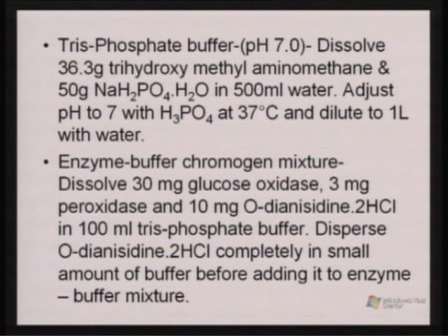Here the adjustment of pH is very important. The tris phosphate buffer must have a pH of 7. So you need to take care at the time of analysis. You should adjust the pH at the time of analysis only. It should not be an old solution.